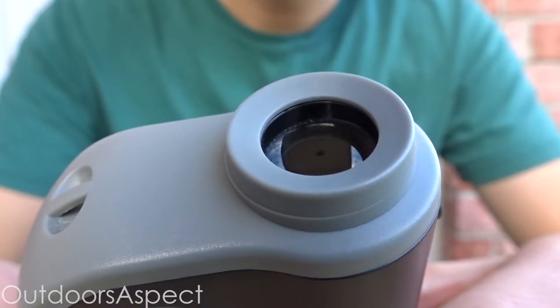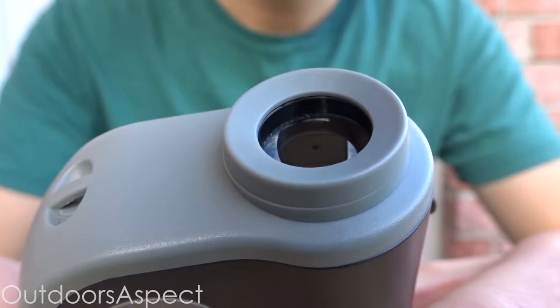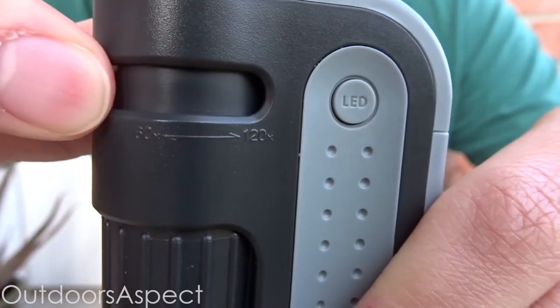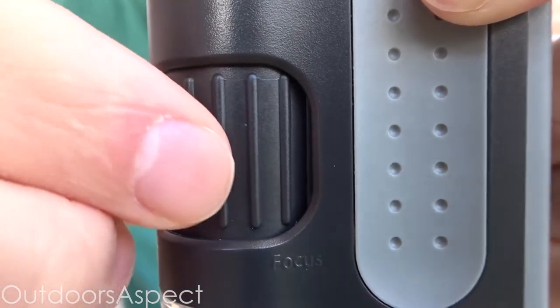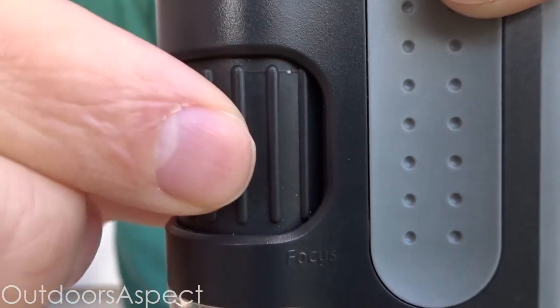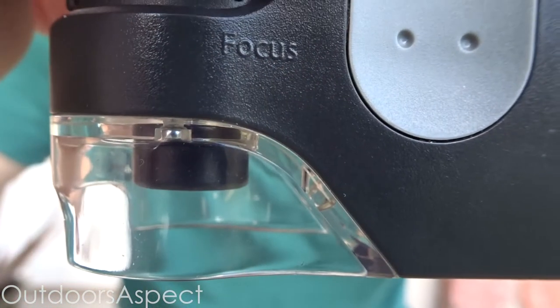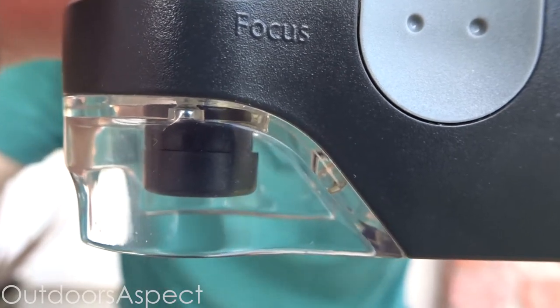The first feature is the eyepiece — this is what you look into to see your specimen. Next is the zoom knob, which increases magnification from 60 to 120 times zoom. Then there's the adjustment wheel, which you use to fine-tune and get the clearest view possible of your specimen. As you turn the adjustment wheel, it moves up and down.